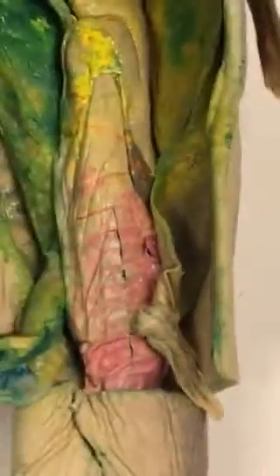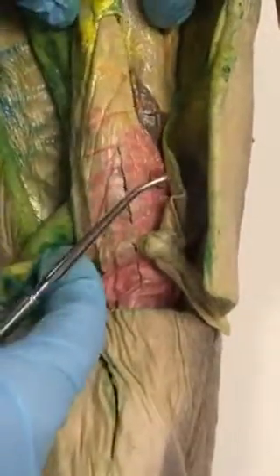Okay. It might not be yellow on everybody's. So is it above or below the artery? They kind of go more toward the side. What is this big thing that all these are on? Those are the intestines. Well, yeah, the intestines.